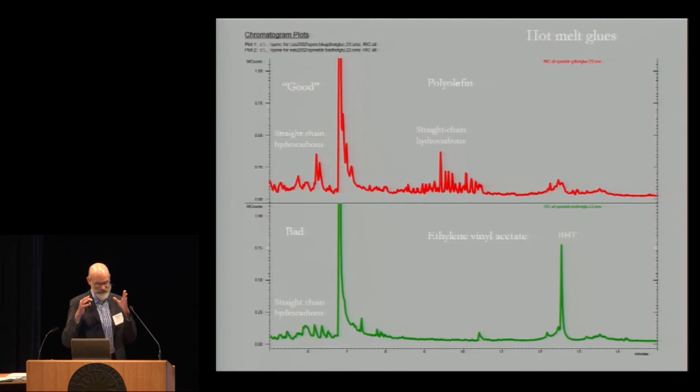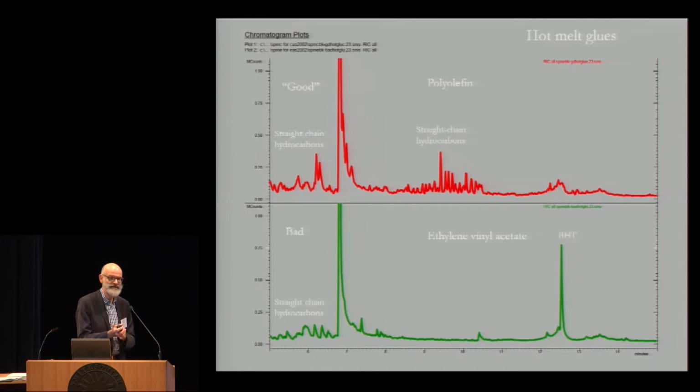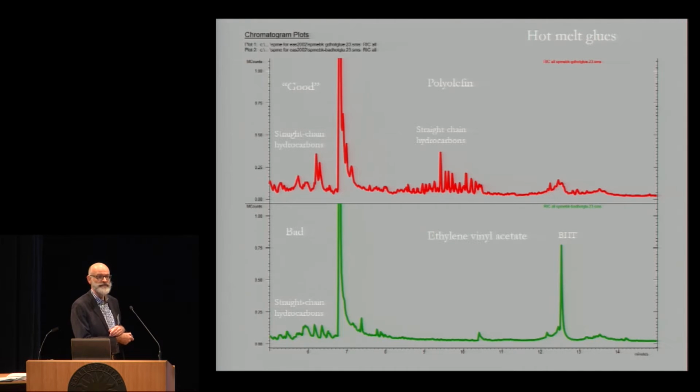But this one that did pass the Oddy test, there are quite a number of things that are being off-gassed, but with this GCMS technique, you then know what these materials are, and these are all straight-chain hydrocarbons, so effectively non-reactive materials. So if you're okay with very, very tiny amounts of effectively wax floating around in your chamber and perhaps depositing, perhaps not depositing on your object, then this would be a fine material to use. And in many cases, because it's a hot melt glue, it's a very thin bead, it's a very small amount that would be exposed in an exhibition case. There are times in which this would be fine to use, I think, even though it is off-gassing materials.